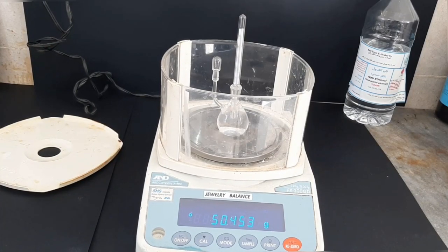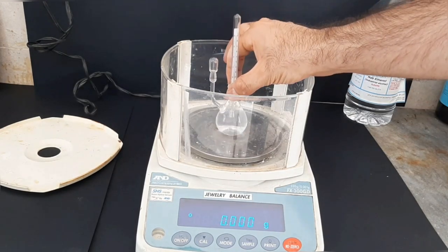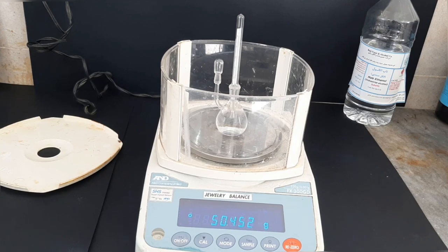So this is the gross weight of the pycnometer. We will subtract the weight of the empty pycnometer from it. This will yield us the net weight of the solvent inside the pycnometer. Then we will divide it by the calibrated volume of the pycnometer. This will get 0.899 gram per cubic centimeter, which is a 98.5% pure product.